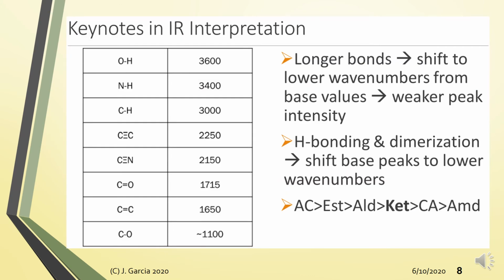Okay, so some tips in interpreting your IR. You don't need to memorize the very long IR table. Ano yung kailangan maalala dito? Again, to reiterate, information sa IR is based on, number 1, yung peak position, yung wave number corresponding to the peak; the intensity of the peak, ano ba yan?